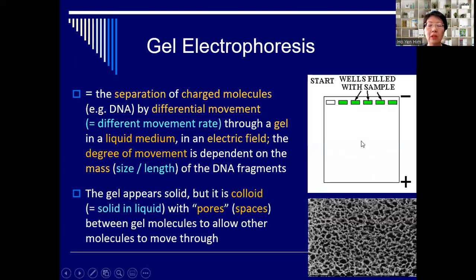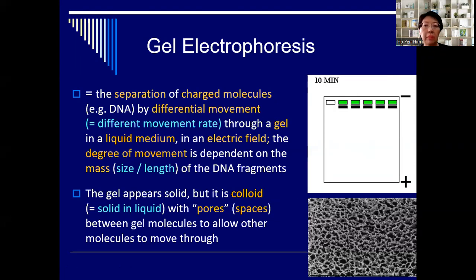Now, the gel appears solid to our eye. The gel is like the agar that you eat, right? But this gel, you cannot eat. So the gel looks solid, but actually it's a colloid. Colloid in this case means solid in liquid.